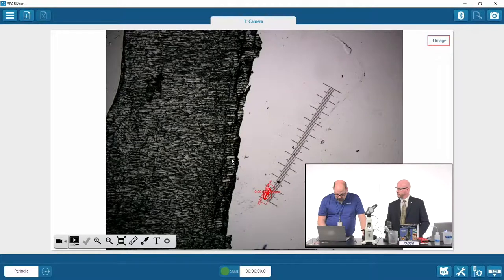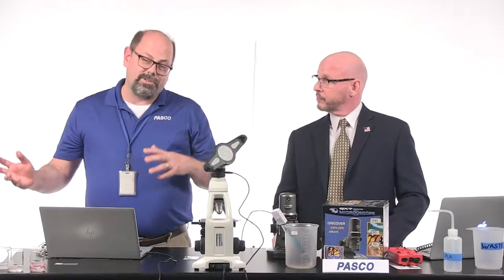the width of, for instance, even just some of these cells that they see on the side. I'll measure one, and we'll move on then to get my ruler. Let's measure the width of this little guy that's right there. So one cell inside of each of these, of course, it's just dark enough in there. I think it's 1.5 micrometers that we're getting in, so that students can understand just how big cells are, how big parts of those cells are. They can then use them to determine how cells are dividing.